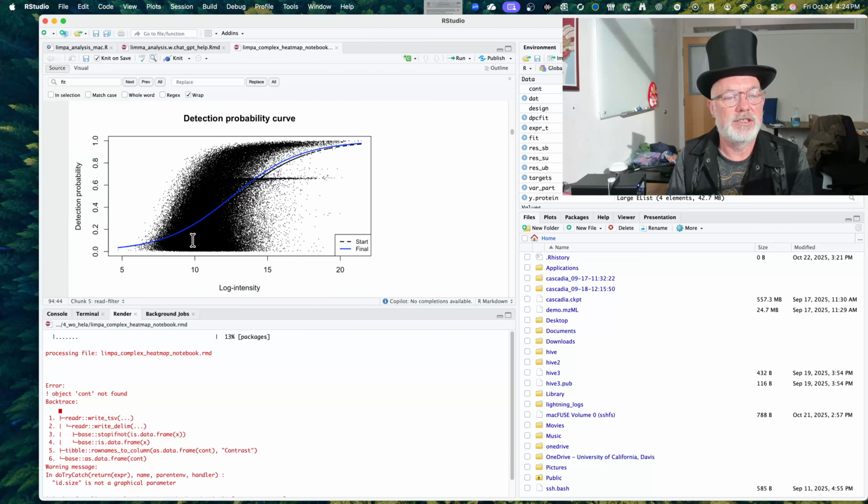So let's see, this is your curve. It looks like a pretty funky curve if you ask me. I guess it kind of doesn't look like, I don't know, is that fitted? I don't know how to read this. It looks kind of funky, but anyway, we're gonna go for it for now.